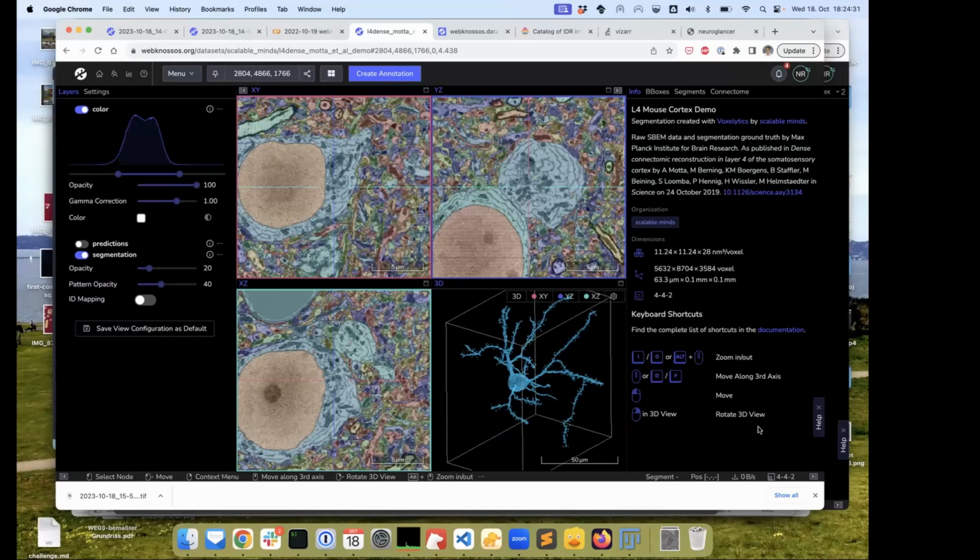Hi. It's maybe a bit of a weird question, but is there or could there be a same like group or hierarchy system for the bounding boxes as for the segments? So if I want to make a group of bounding boxes separate from one another.